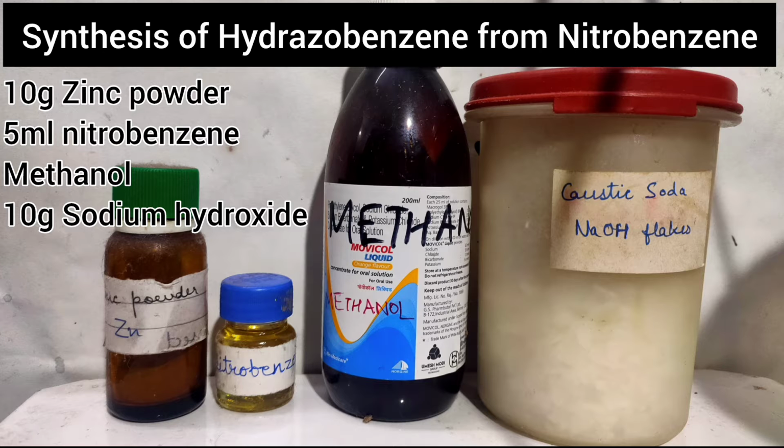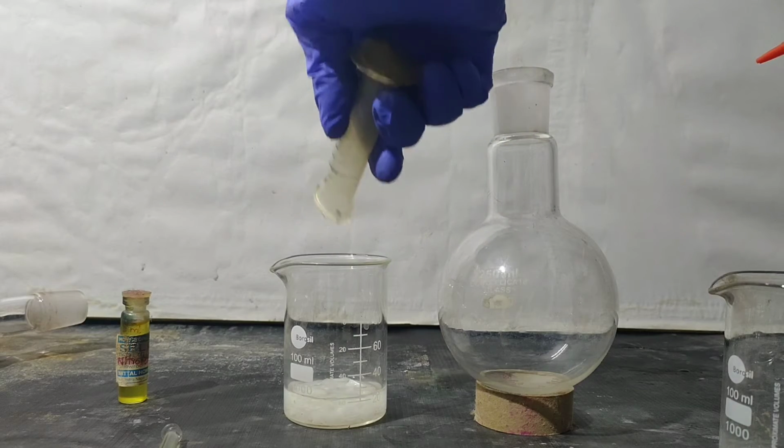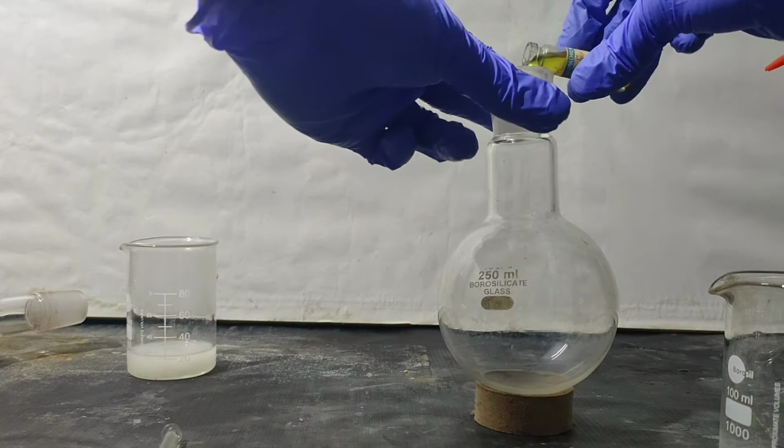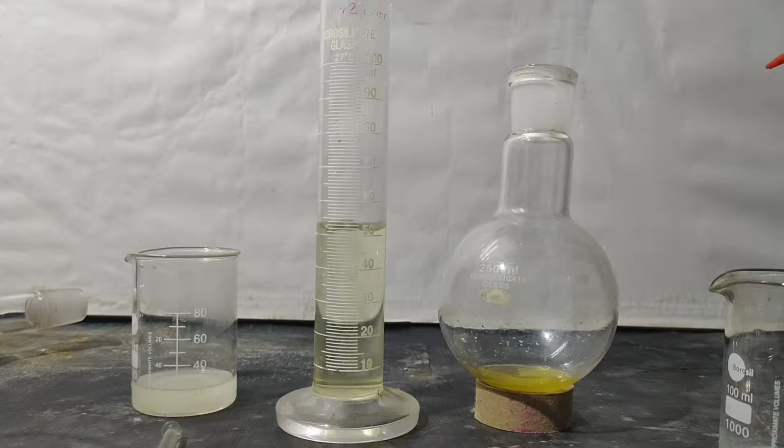To make hydrazobenzene, I took 5 ml of nitrobenzene, 10 gram of zinc powder, 10 gram sodium hydroxide and methanol. Then I dissolved the sodium hydroxide in 20 ml of distilled water and transferred the nitrobenzene into a 250 ml round bottom flask.